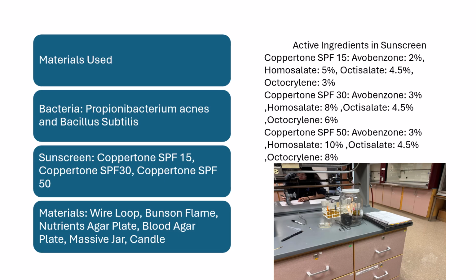And this down here is a picture of the materials we used. You can see the jar, the candle, all the bacteria in there. You can't quite see the wire loop there, but it is there, I promise.